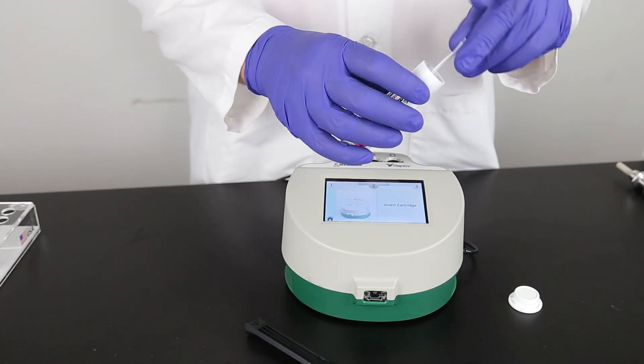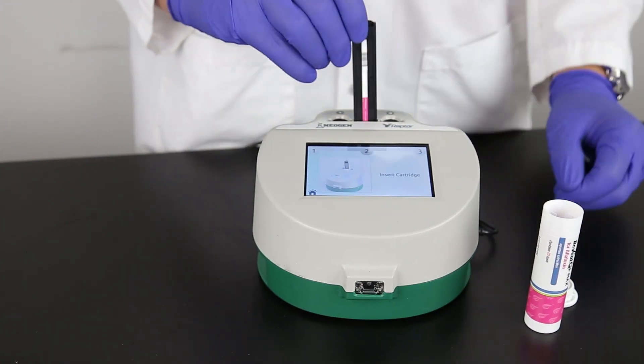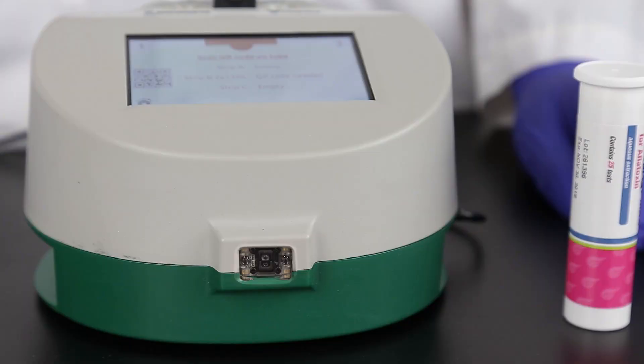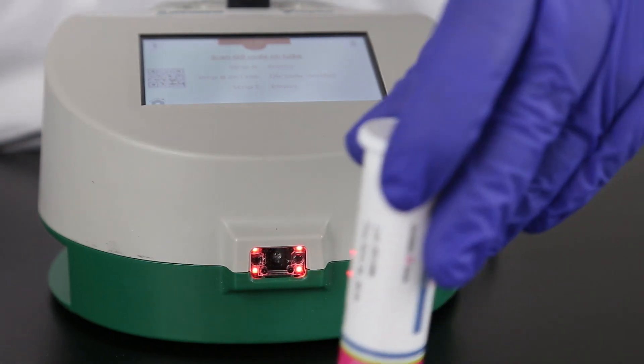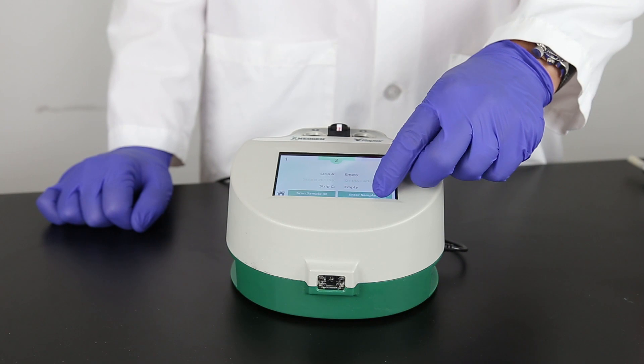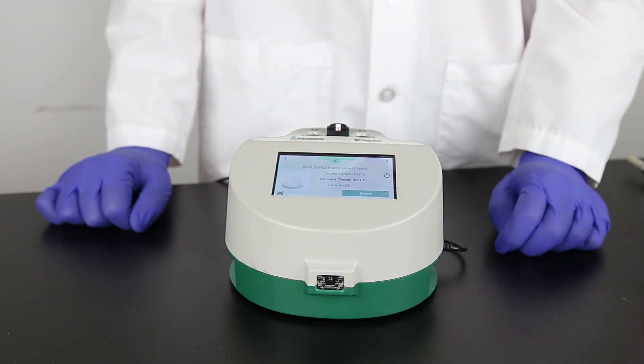Place a test strip into the Raptor cartridge, then place the cartridge in the Raptor system. You can use any of the three ports. The Raptor system reads the barcode on the strip. If you need to add the lot information to the system, the scanner on the front of the system will turn on automatically. Scan the QR code located on the strip tube. Enter a sample ID if you like. This can be done manually or, if you barcode your samples, by using the scanner in front of the system.